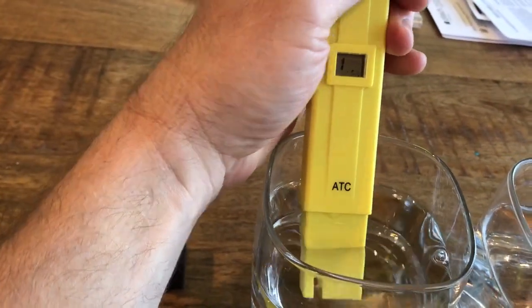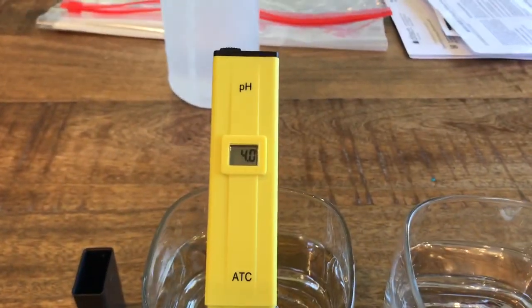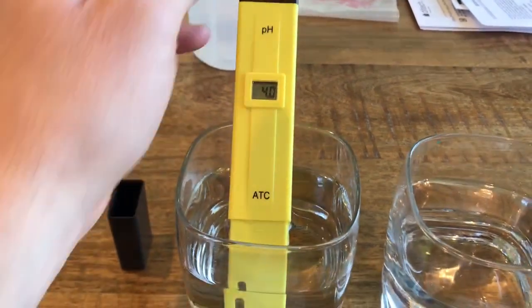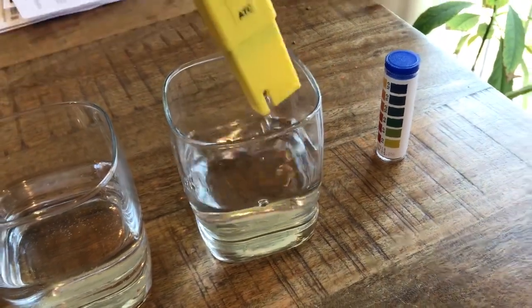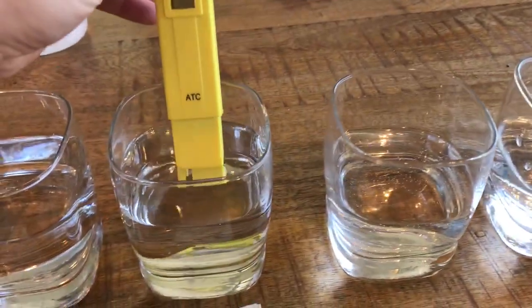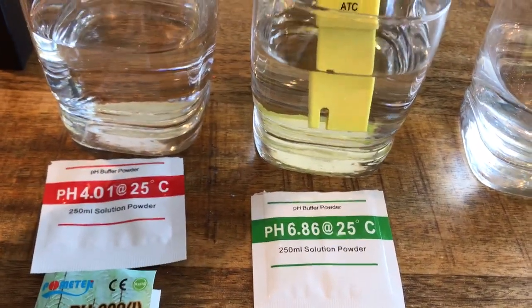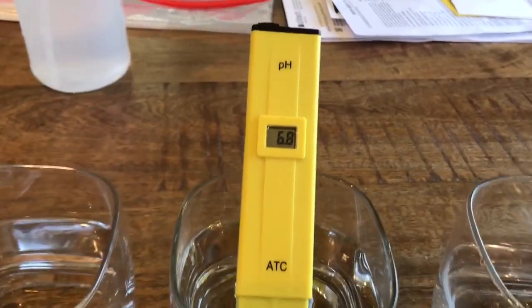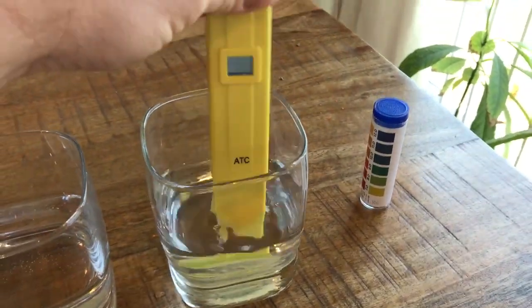So first we've got a pH reading — it's reading 4.0. Then what it says is take your distilled water, give a little shake, put it in, and this should read 6.8 — right on the money. So wash it off.